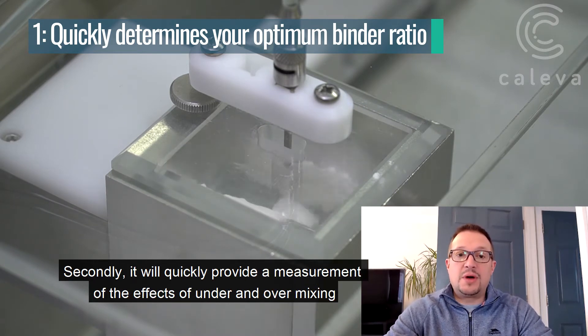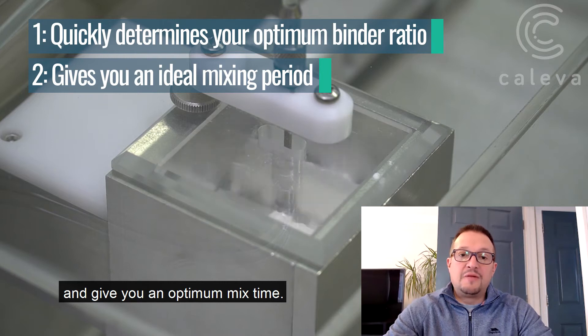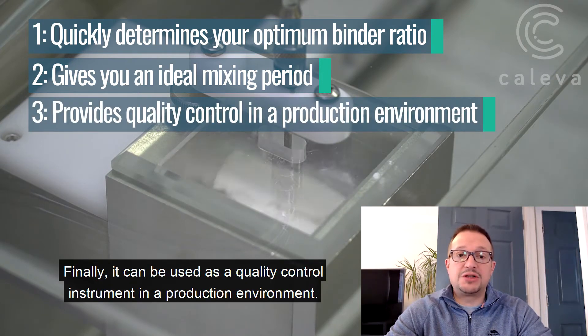Secondly, it will quickly provide a measurement of the effect of under and over mixing and give you an optimum mix time. Finally, it can be used as a quality control instrument in a production environment.